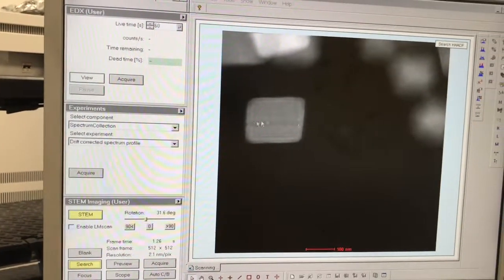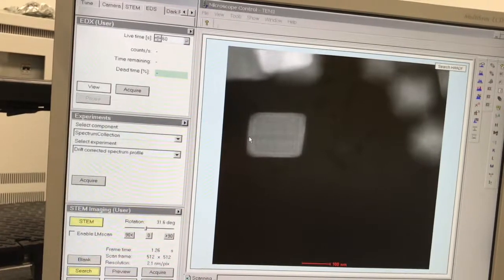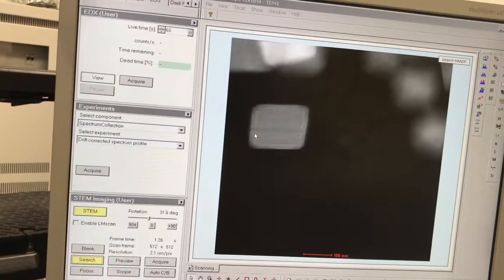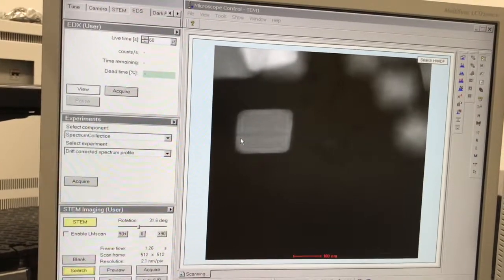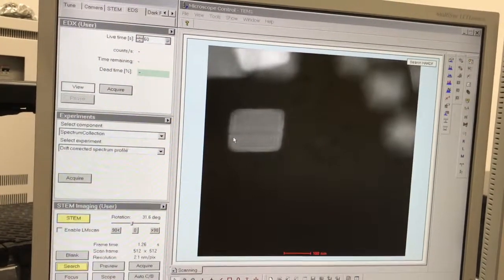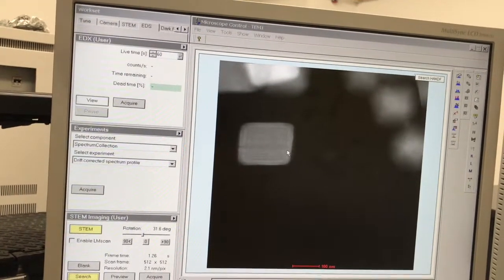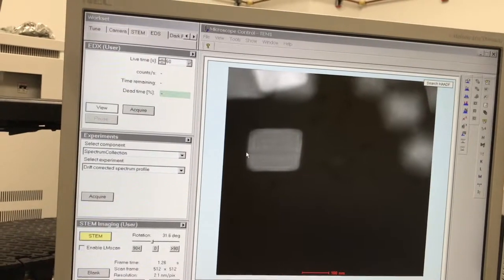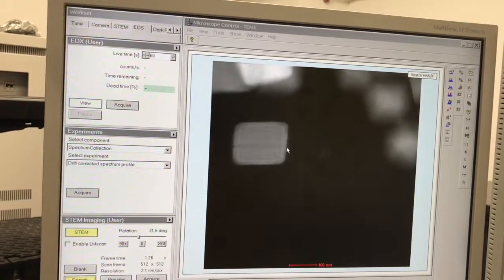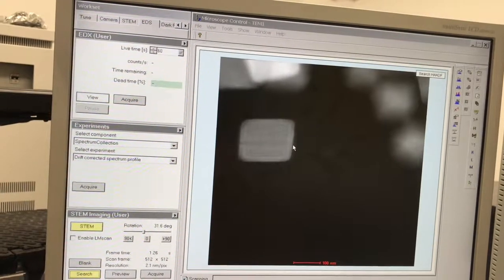That line from where we scanned across is very common — most likely it's carbon contamination buildup. Plasma cleaning samples may help avoid that, though some samples are more prone to it than others. This is a fairly old specimen on a support film, so minimal cleaning can be done. It could also potentially be some form of beam damage if the specimen is beam-sensitive. If you're seeing this in your line scan after you're done, you're either getting contamination buildup or beam damage. If we want to do a map now, let's find another particle we haven't already affected.